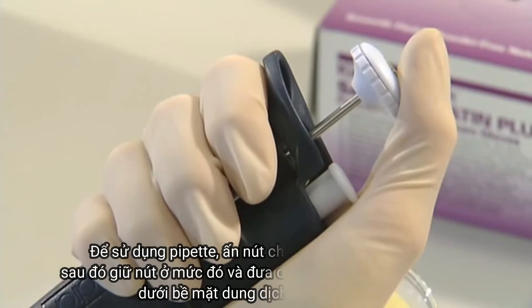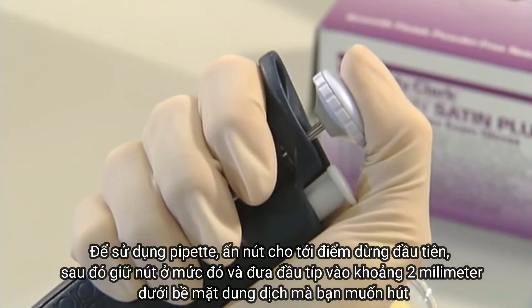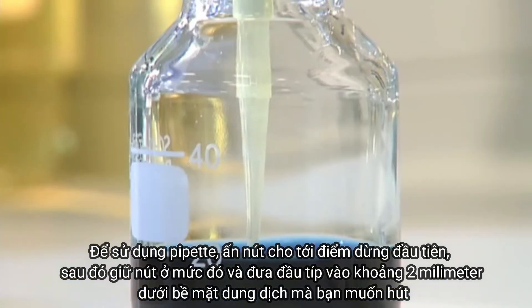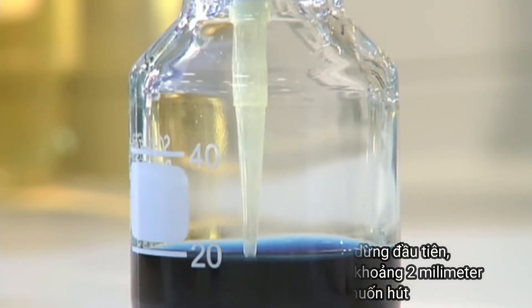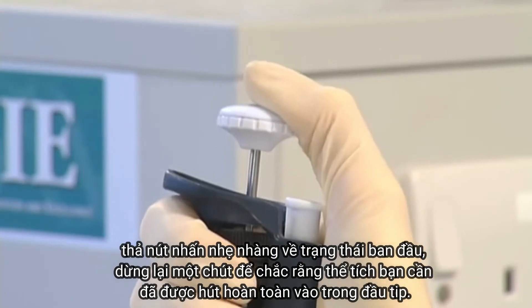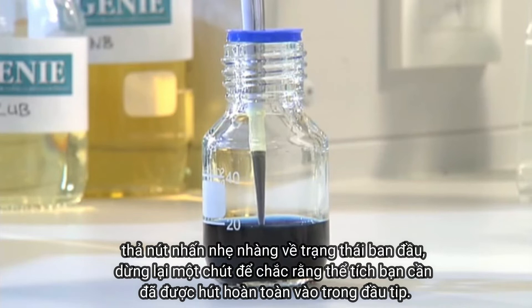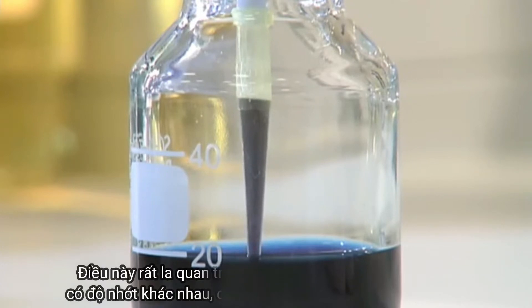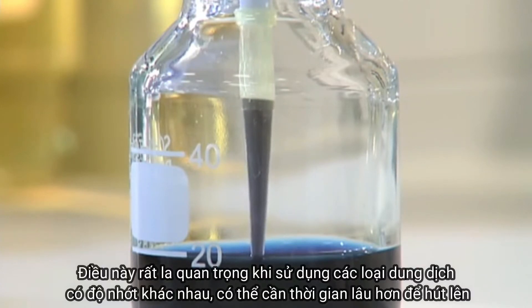To use the pipette, push the button down to the first stop. Then, keeping the push button at this level, place the pipette tip about 2 millimetres into the liquid you wish to draw up. Release the push button by slowly allowing it to return to its original position. Pause for a second to make sure all the required volume of liquid has been taken up — this is especially important when using more viscous liquids, which take longer to draw up.